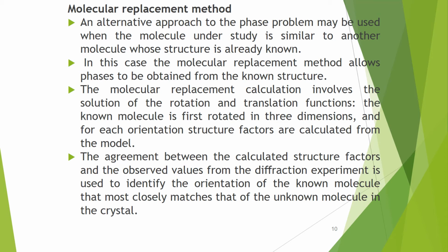The known molecule is first rotated in three dimensions, and for each orientation, structure factors are calculated from the model. The agreement between the calculated structure factors and the observed values from the diffraction pattern is used to identify the orientation of the known molecule that most closely matches that of the unknown molecule in the crystal.